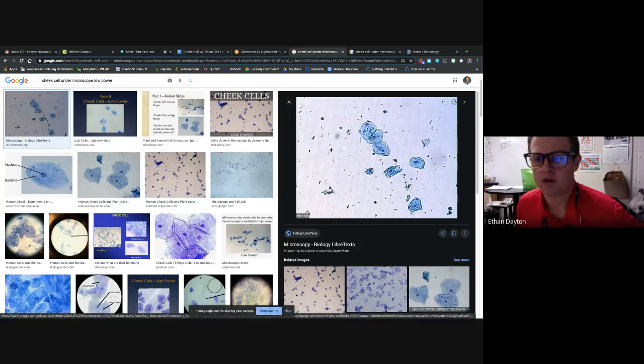Then you should label these. All right, let's take a look. I would label 1 cell, but I would be drawing these. Okay, so if I look at this cell right here where my hand is, I'm going around this cell. I am kind of highlighting the cell membrane. I would draw an arrow to that and label it cell membrane.